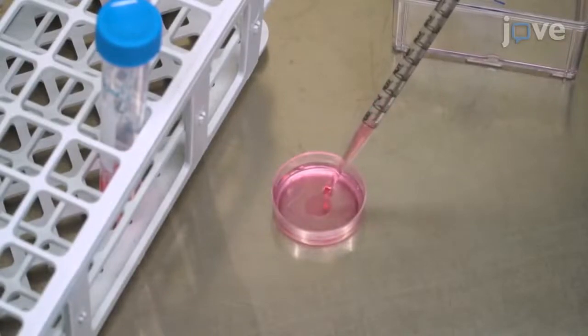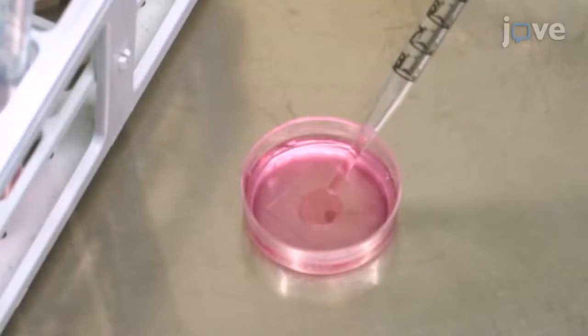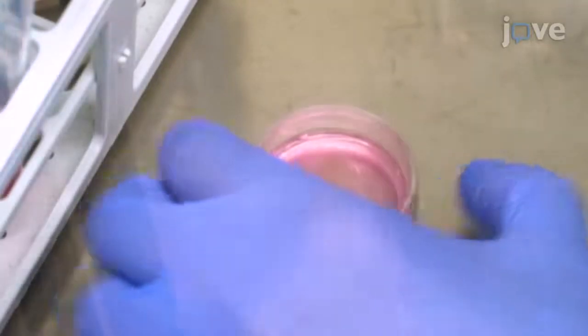On the first day, seed HeLa cells in 1.5 milliliters of complete medium at a concentration of 100,000 to 200,000 cells per milliliter.